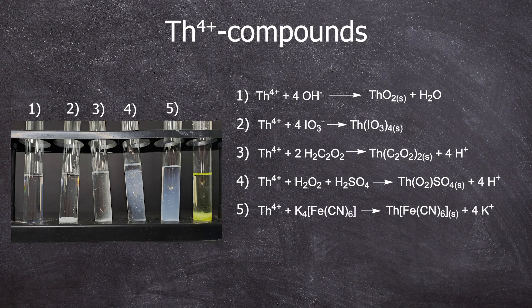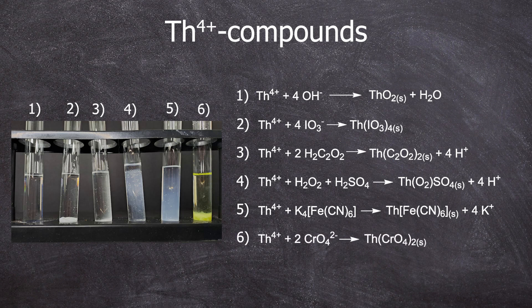The fifth test tube was used for thorium hexacyanophariate, a somewhat exotic compound I think. Thorium chromate was created just to introduce some color in this video because all the other precipitates were just white.